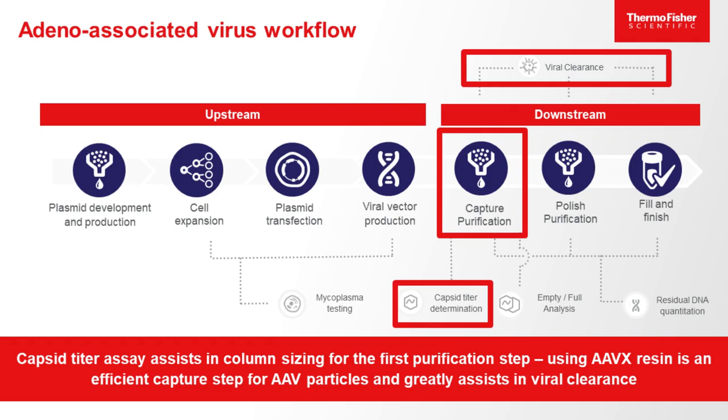Okay, so with the confirmation that the bulk harvest is Mycoplasma free, the clarified harvest is now ready for downstream processing, and Chantelle will go into the detail. Thanks, Ilaria.